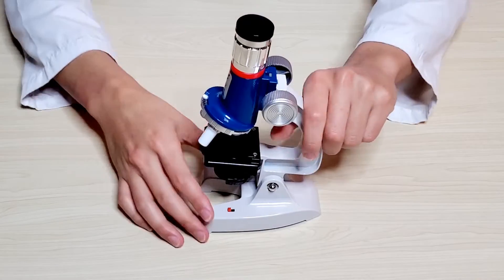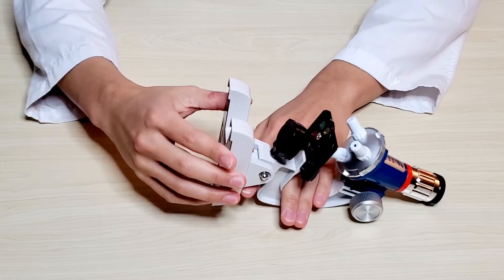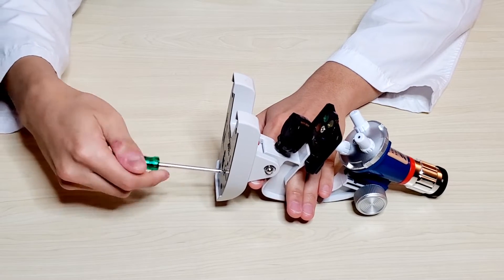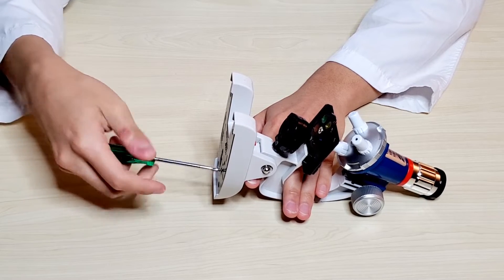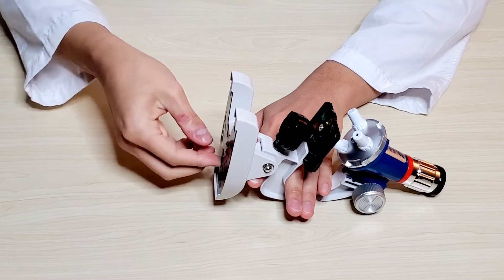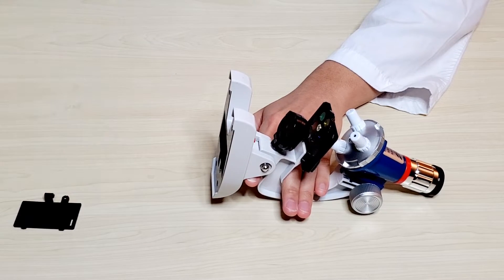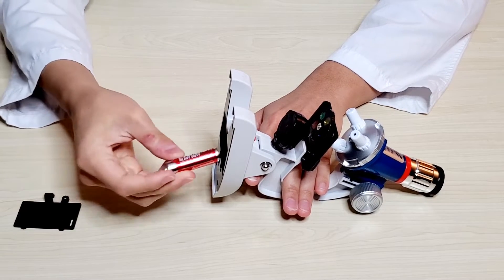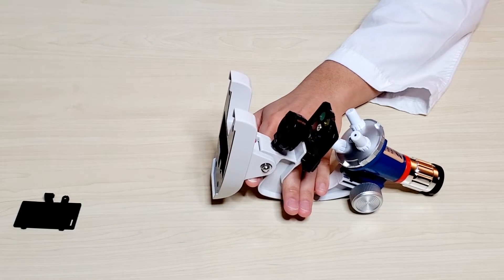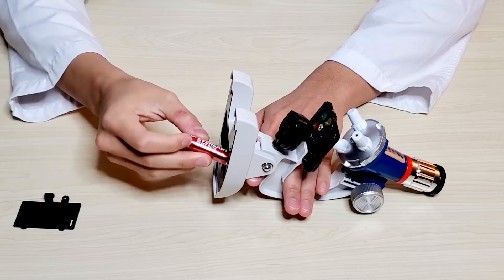Now we'll be putting in the battery of the microscope. If you need a parent to help, don't be embarrassed to ask. Don't forget the flat side is the minus side which goes to the spring, and the bump side goes to the flat side.